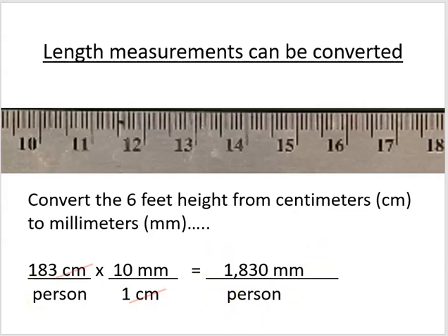1,830 millimeters tall. So I wanted to do this introduction to get people used to thinking about how we can do these number conversions, and to get people familiar with this, because we're going to start using this and looking at a ruler that is built into our microscopes to be able to start measuring the length of our specimens at the microscopic level.